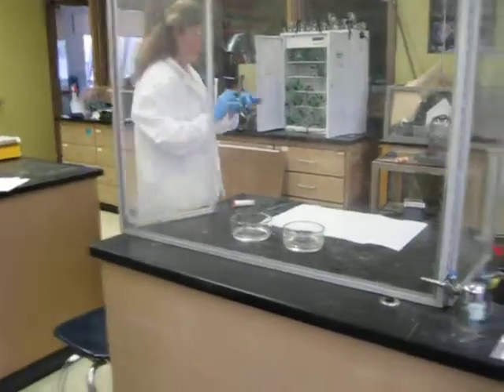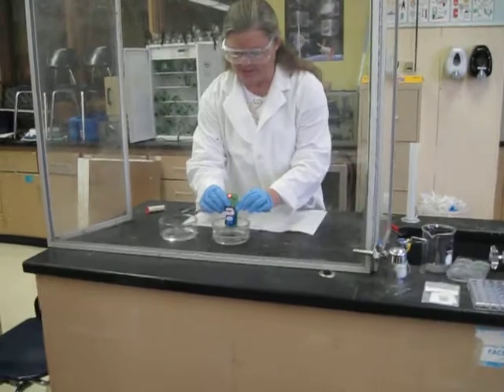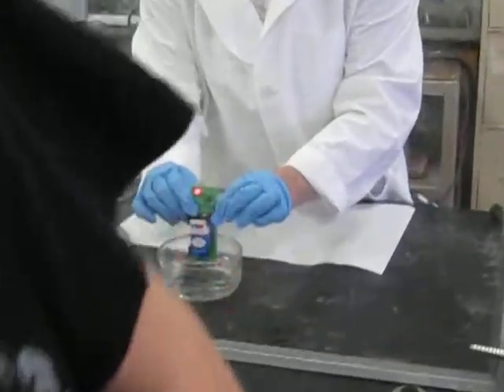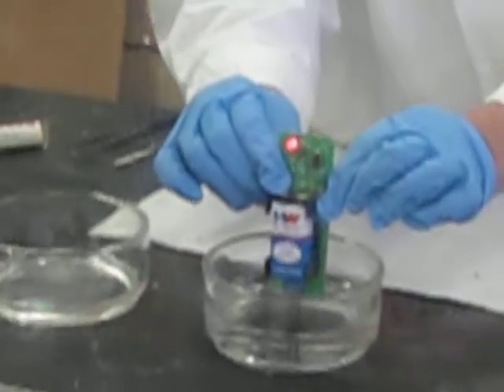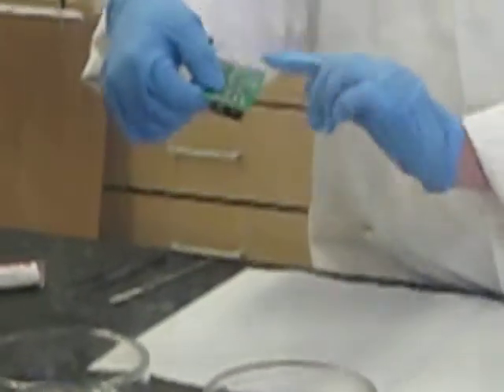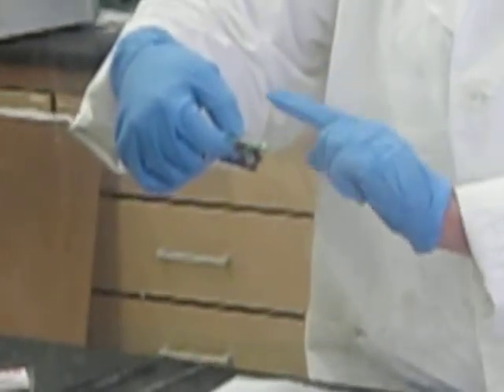So this is a conductivity tester. And we look at this and what happens to the lights. It's red, bright red, like Rudolph bright red. Is the green light on at all? No. Alright, so we have some red and we have no green light. I look at the back right here and it says red and no green is dim, low conductivity. So you're writing low conductivity for before the chemical reaction.